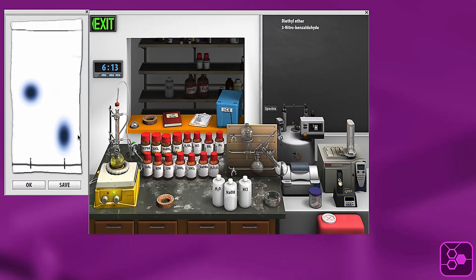So that's how you do a TLC. You can save these TLC plates in your lab notebook and make comments about the time when they were taken and so forth. But it's pretty straightforward.